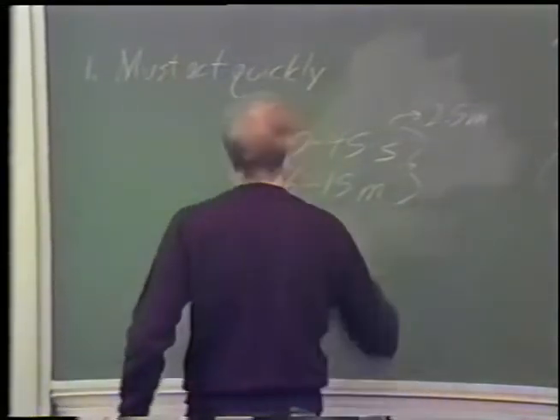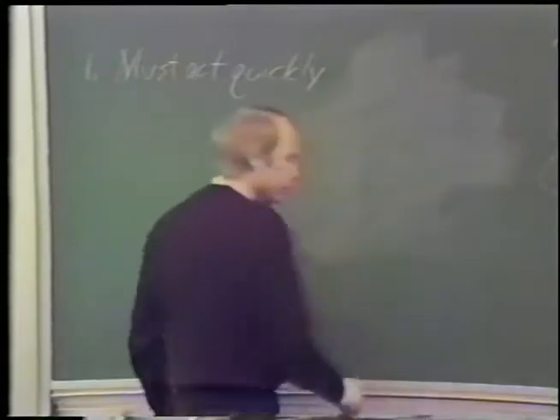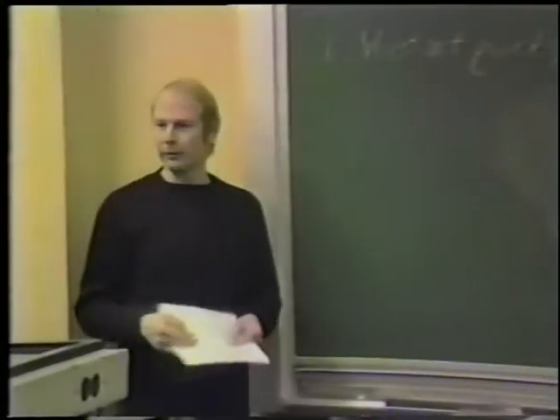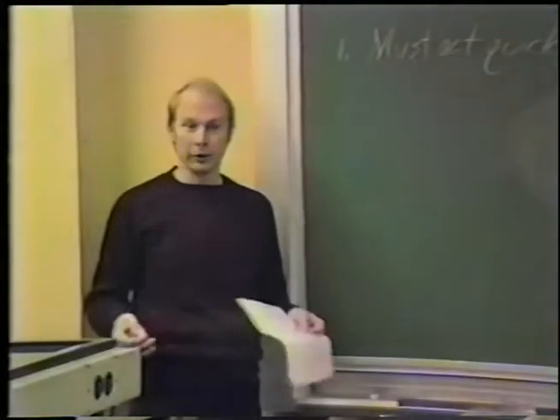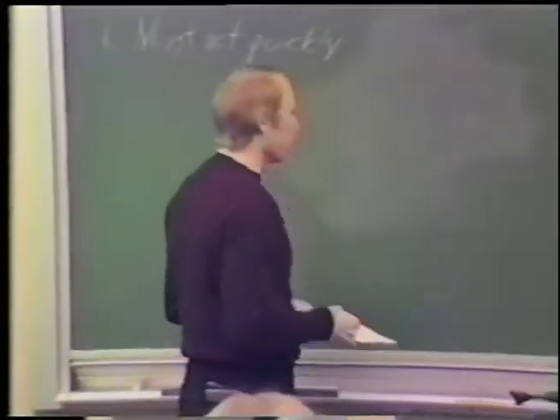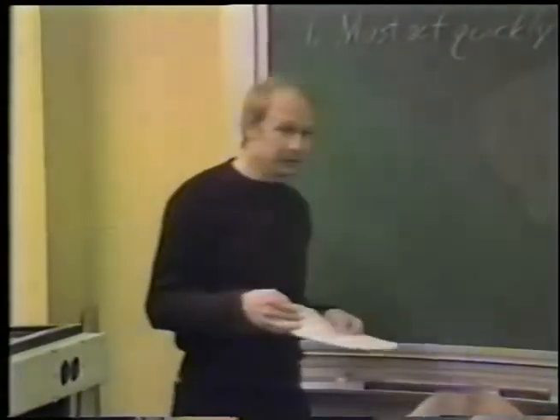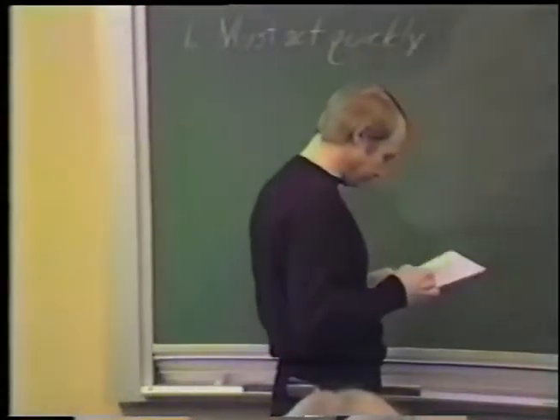So it's pretty clear chemical fixatives aren't of much use in studying relatively transient events that occur on the scale of a few seconds or less. And it's also clear that they don't do a very good job of preserving what we know is there to begin with. We'll go into that in a little more detail later. Okay?